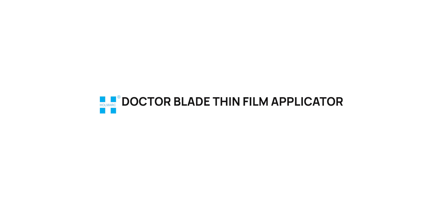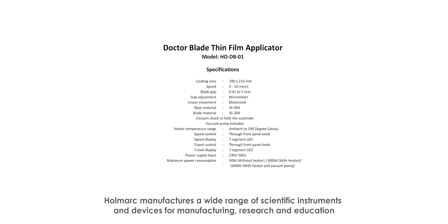Holmarc's Doctor Blade Thin Film Applicator, Model HO-DB-01. Holmarc manufactures a wide range of scientific instruments and devices for manufacturing, research, and education. Visit us at www.holmarc.com and contact us at sales@holmarc.com. Order your products now.